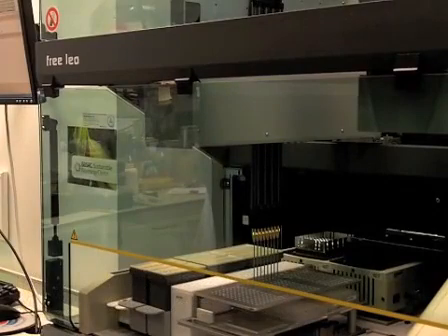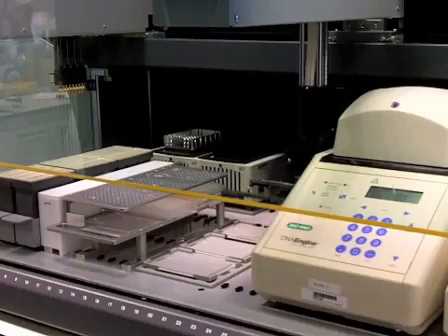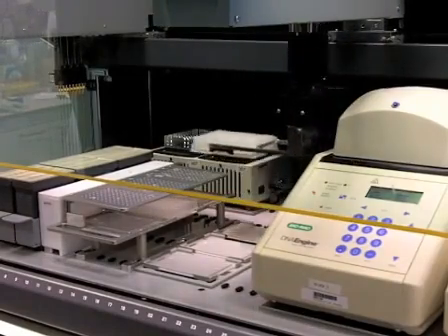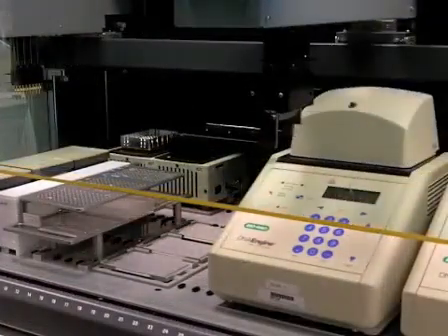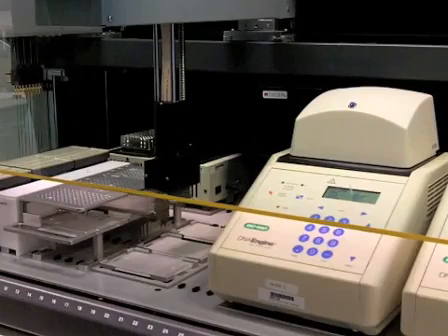Finally, 50 microliters of MBTH reagent is pipetted into the PCR plate. The deep well plate is stored after the completion of the transfer of the hydrolysate to the third PCR plate, whereas the PCR plates are moved to the thermocyclers for incubation at 60 degrees for 15 minutes.